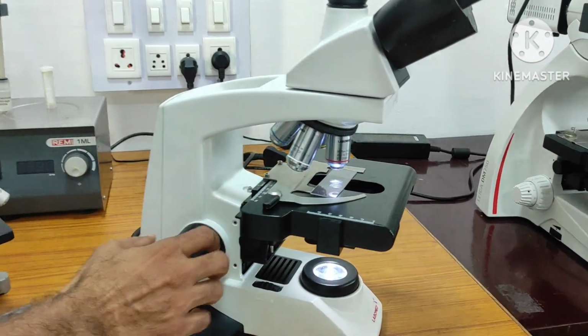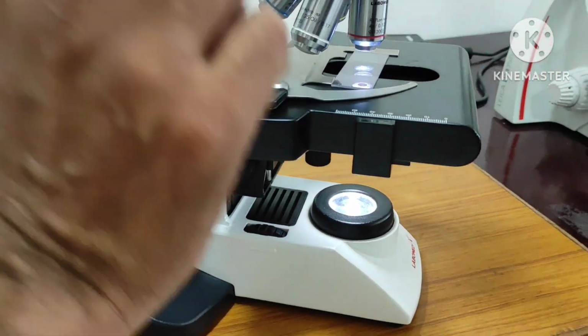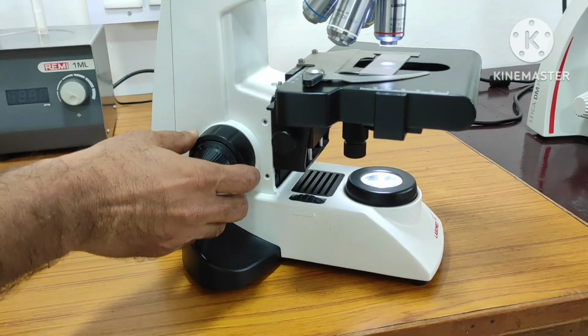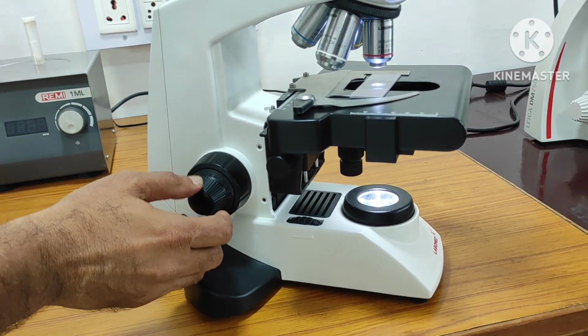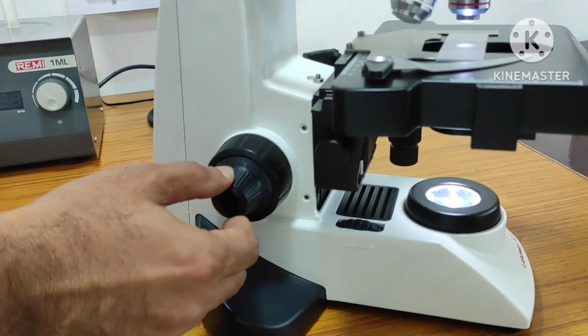You can see that movement, you can observe here, the stage is moving up, right? So that wherever the better resolution and better clarity is there, we can fix it. Then when we reach a certain stage where the specimen is observable through the eyepiece, then for fine adjustments we have to use this fine adjustment knob.